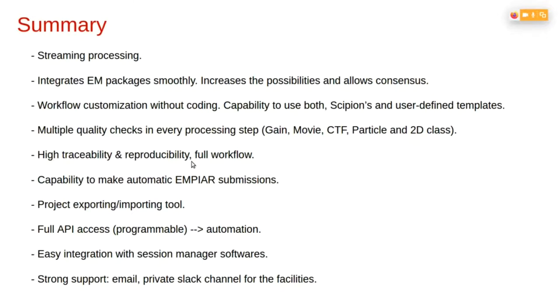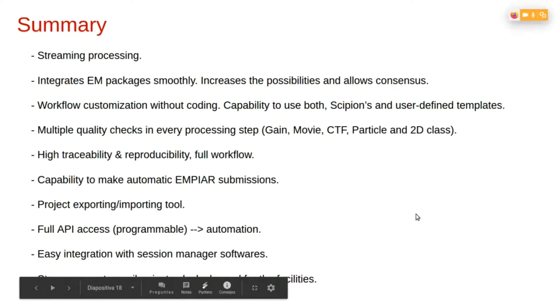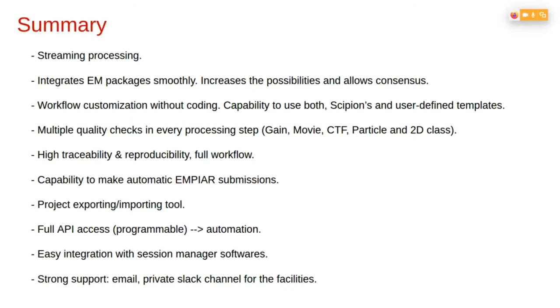Also, we have seen how we are able to make automatic EMPIAR submissions, and how we can import and export projects. Also, the main API of Scipion facilitates a lot the integration of Scipion in the session manager software. And of course, we provide strong support, not only by email, but also through a private Slack channel for those facilities that are interested in implementing Scipion.